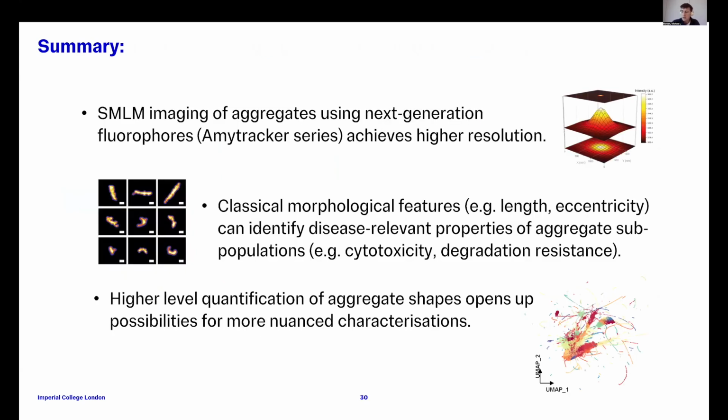So I think that's just coming up to about my half hour, and I hope you've enjoyed this seminar. Just the three big takeaway messages that I hope everyone can appreciate would be that single molecule imaging using these next generation of dyes is a really good way of characterizing these aggregates at a higher resolution than is capable using traditional microscopy.